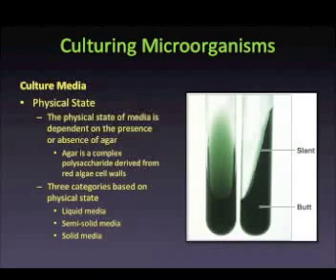Each of the three types of media based on physical state play a specific role in the laboratory setting. The storage of microorganisms would be achieved more easily with a broth or a solid media in a test tube. The solid media in the Petri plate allows growth on a solid surface with plenty of surface area, thereby facilitating isolation of a pure culture.